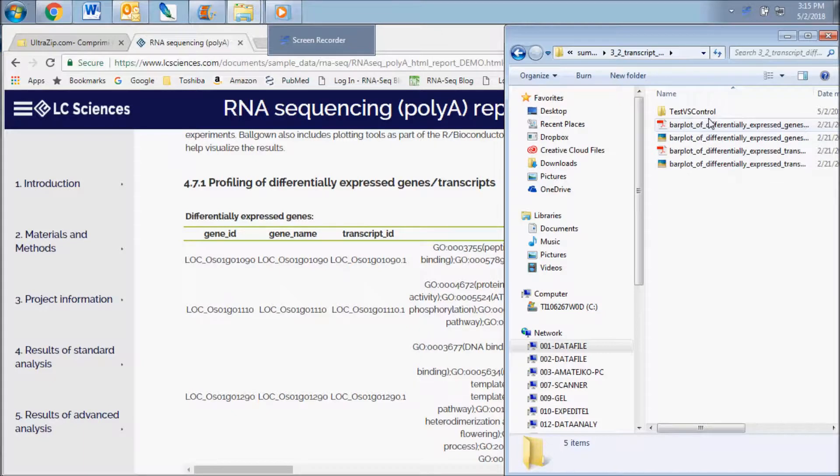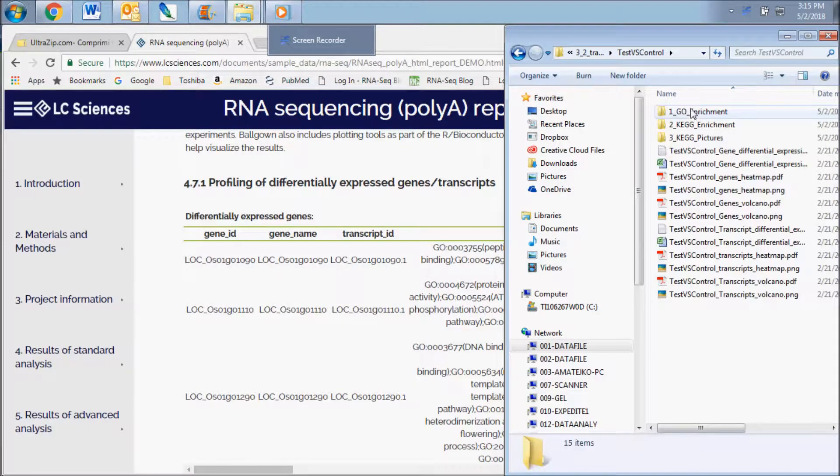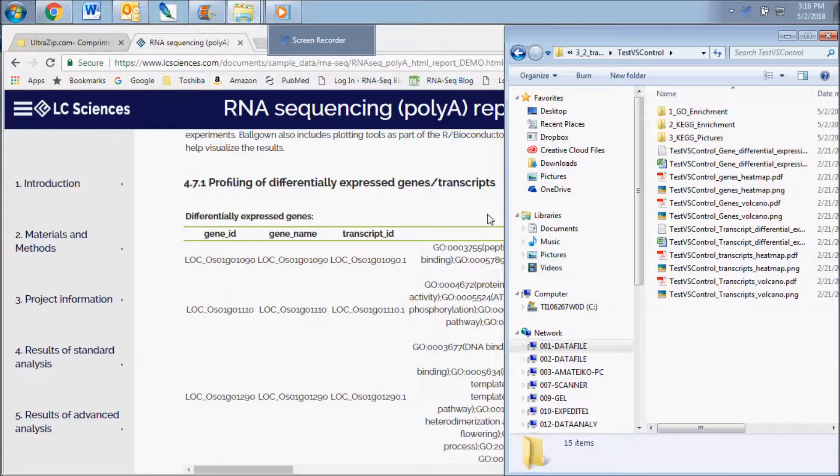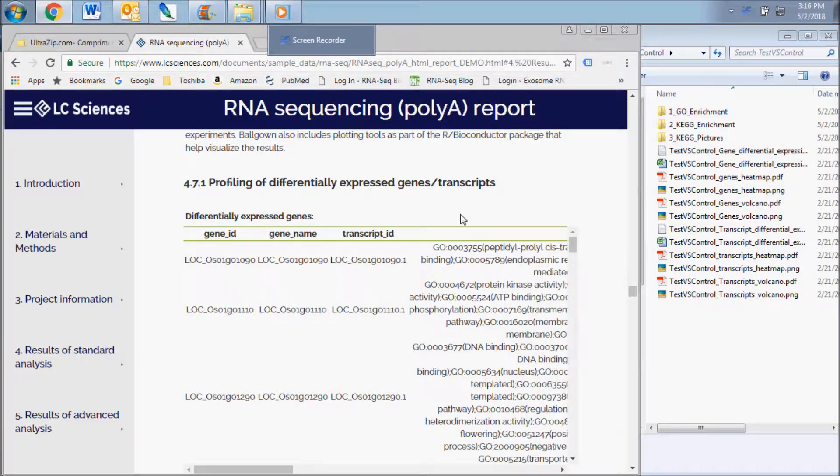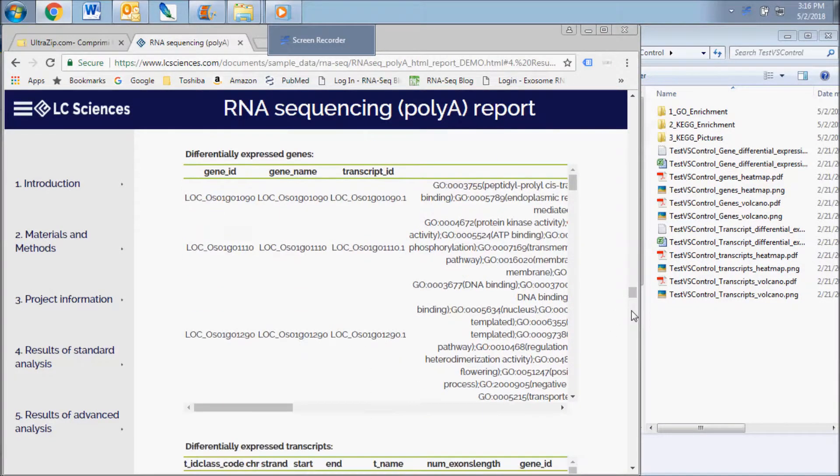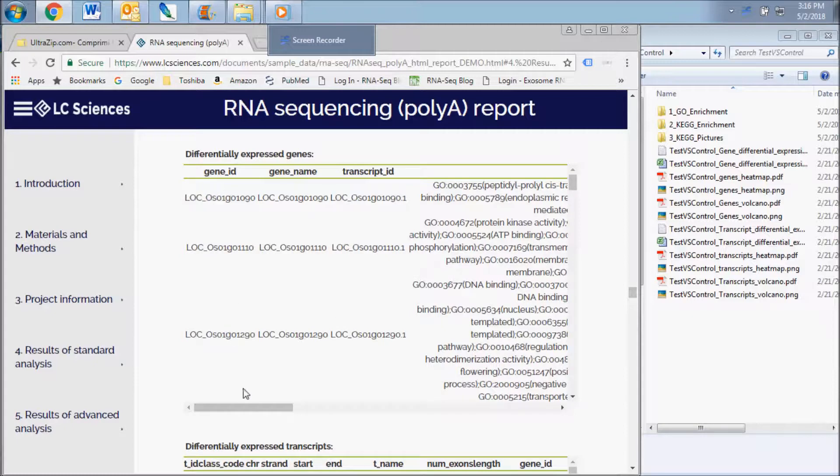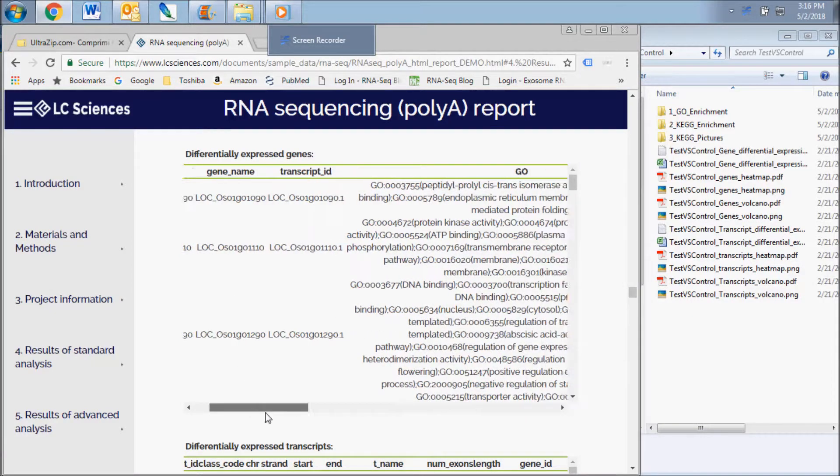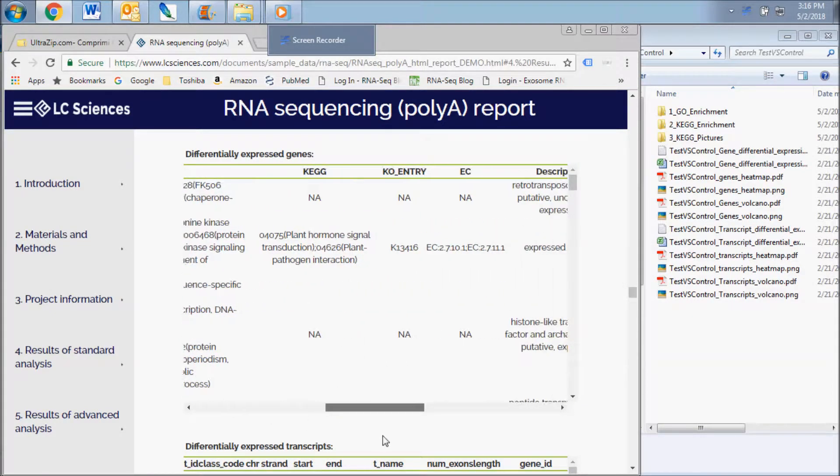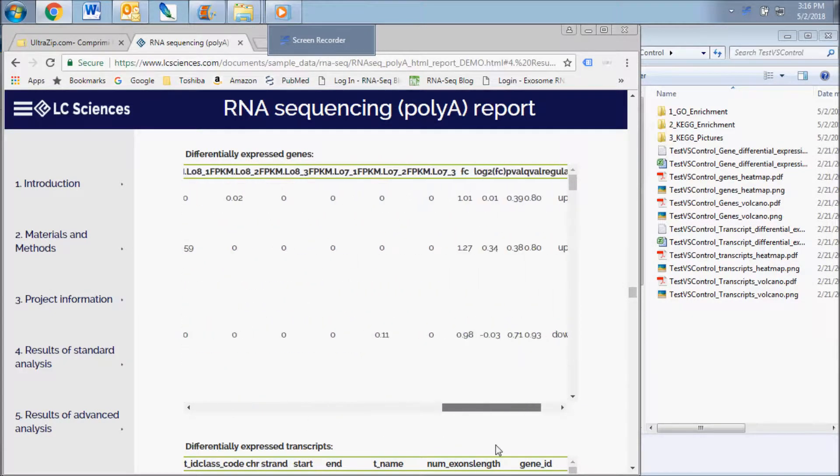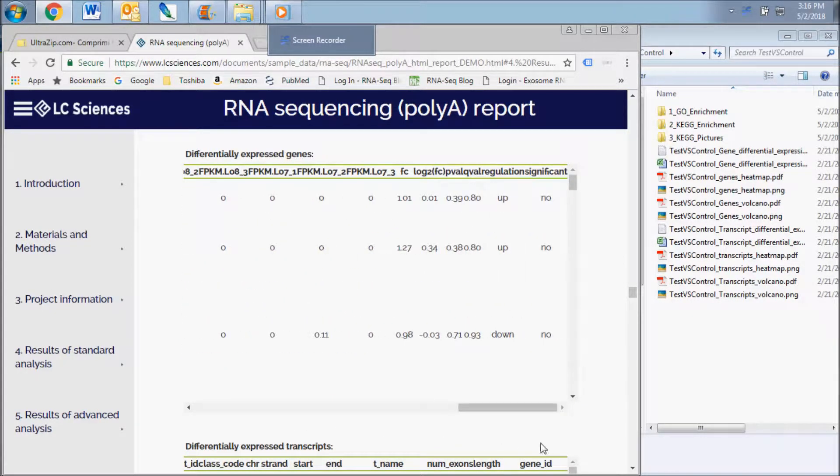Within this folder, you will find a subfolder for each of the group comparisons specified on your analysis request form. The gene and transcript differential expression charts include the FPKM expression values and also the fold change.